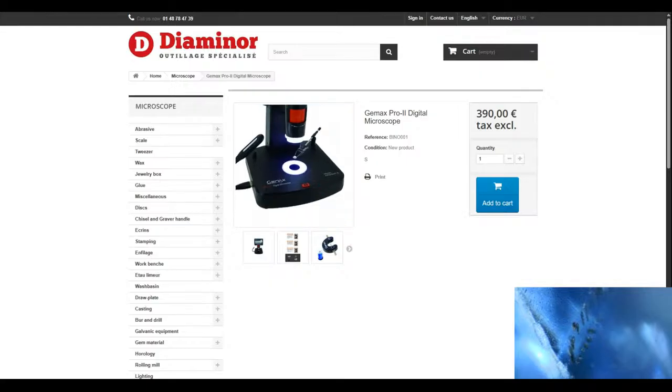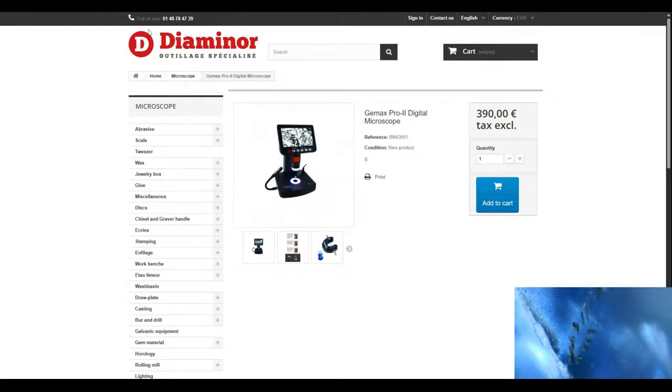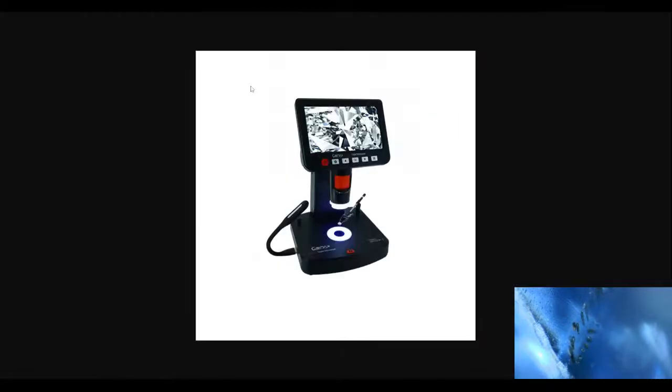That's hilarious. I thought about it because, guys, I'm not sure if you can see this, but we can see this little black spot in the middle. It's kind of like a bootleg dark field illumination, and mine doesn't have that. So I thought maybe I put just something in here and they basically did it. But this is the price increase just because there's a little black dot here. It increased the price now by 100 euros if I would sell it.